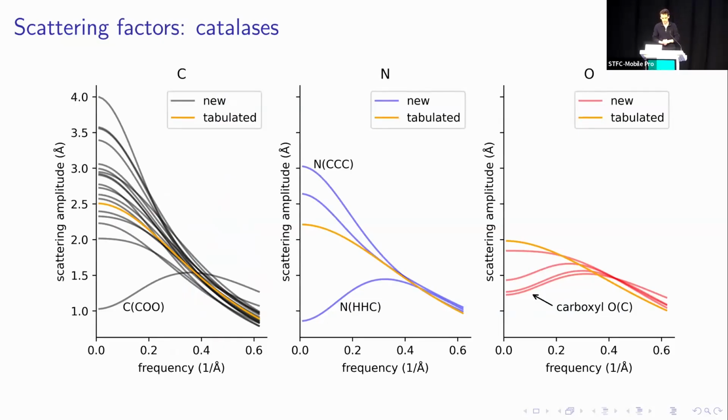So you can see that at a high frequency, they agree with one another. All of the scattering factors are reasonably similar, and that's expected. That's in line with what we expect. At low resolution, there is, however, quite a lot of spread.